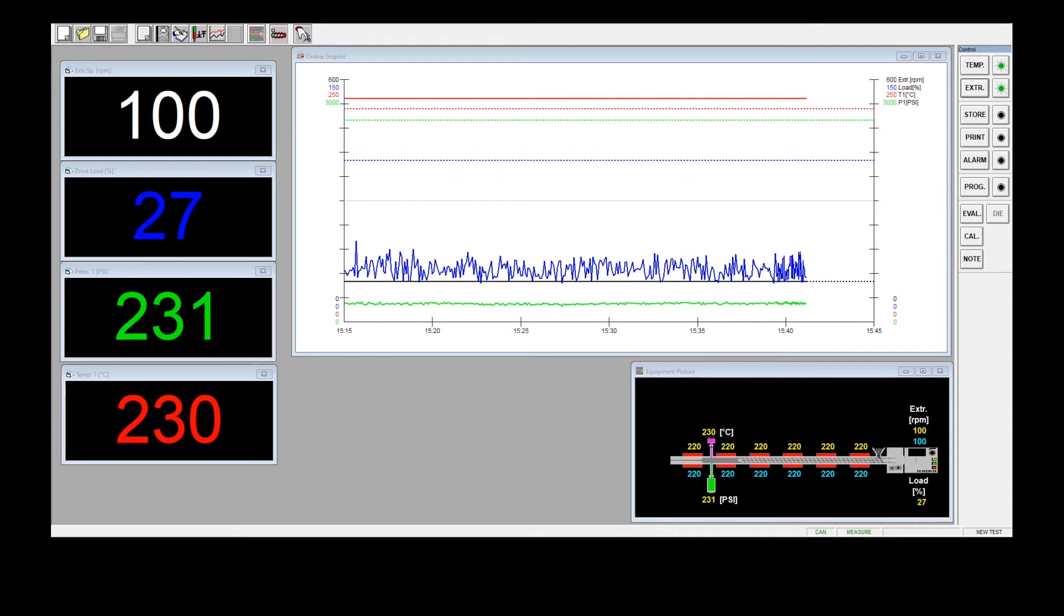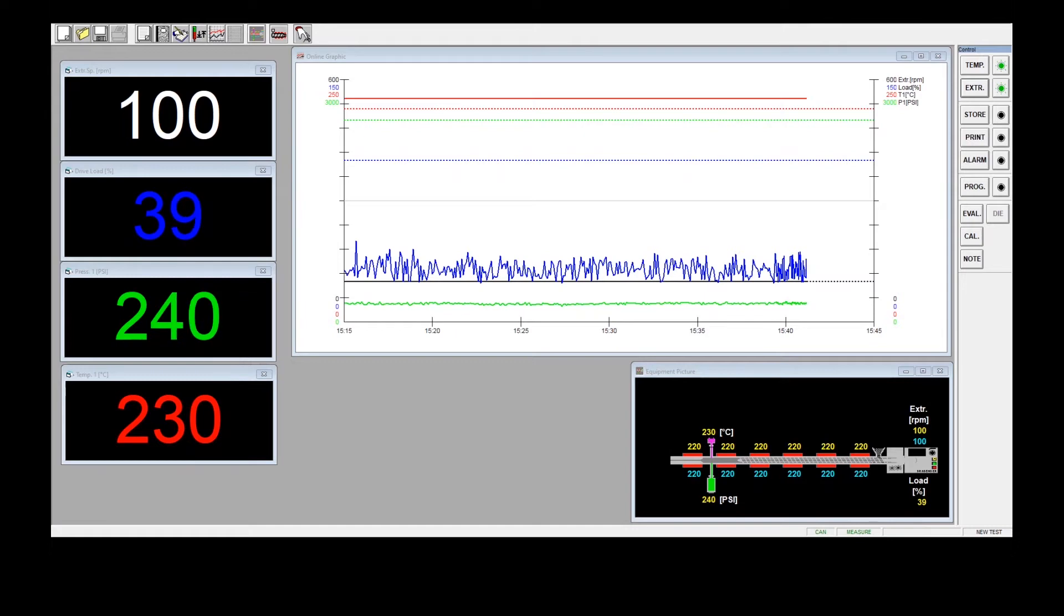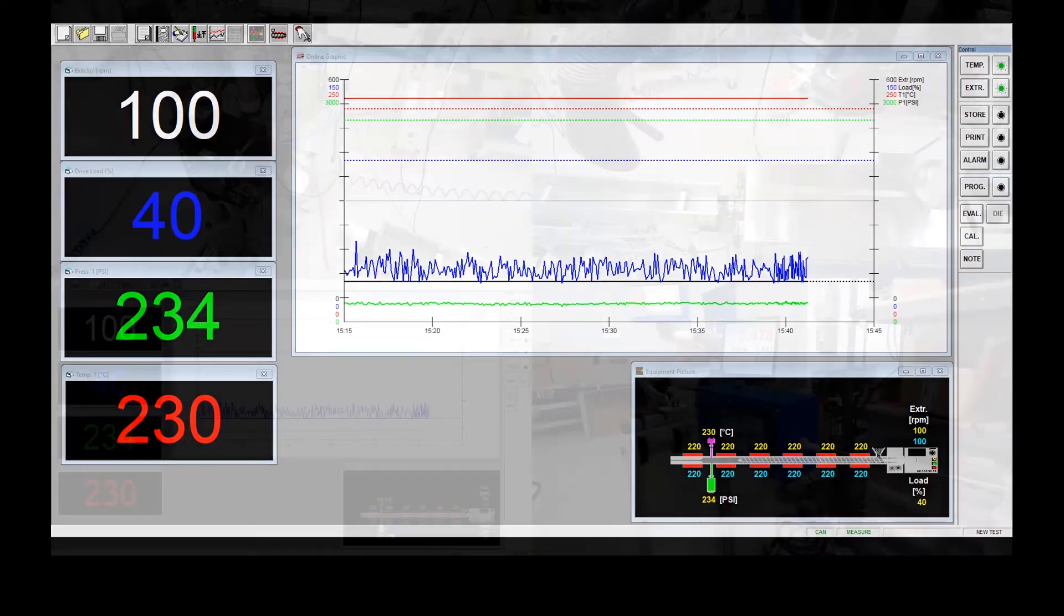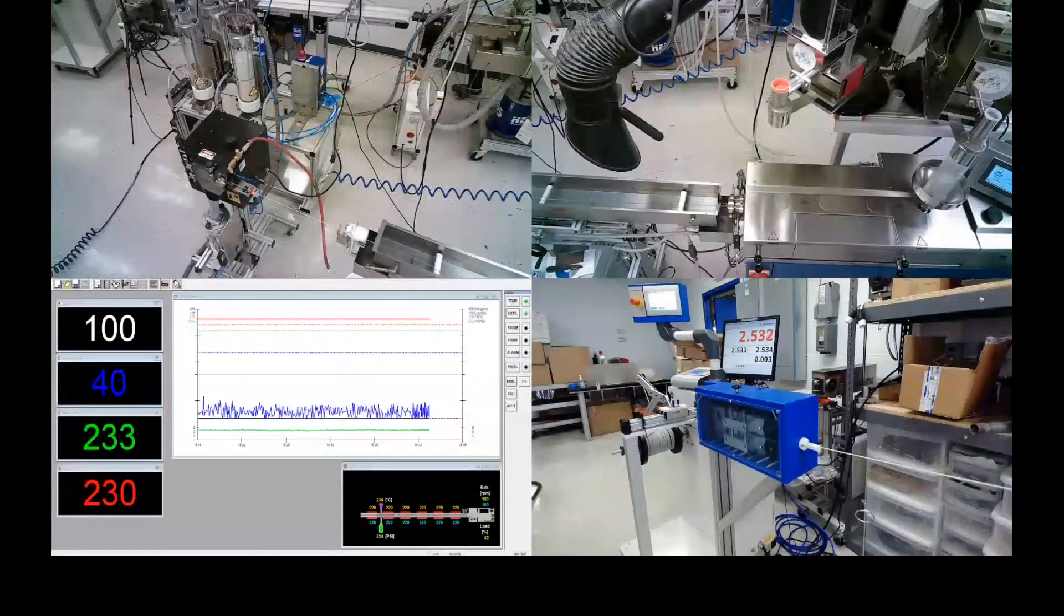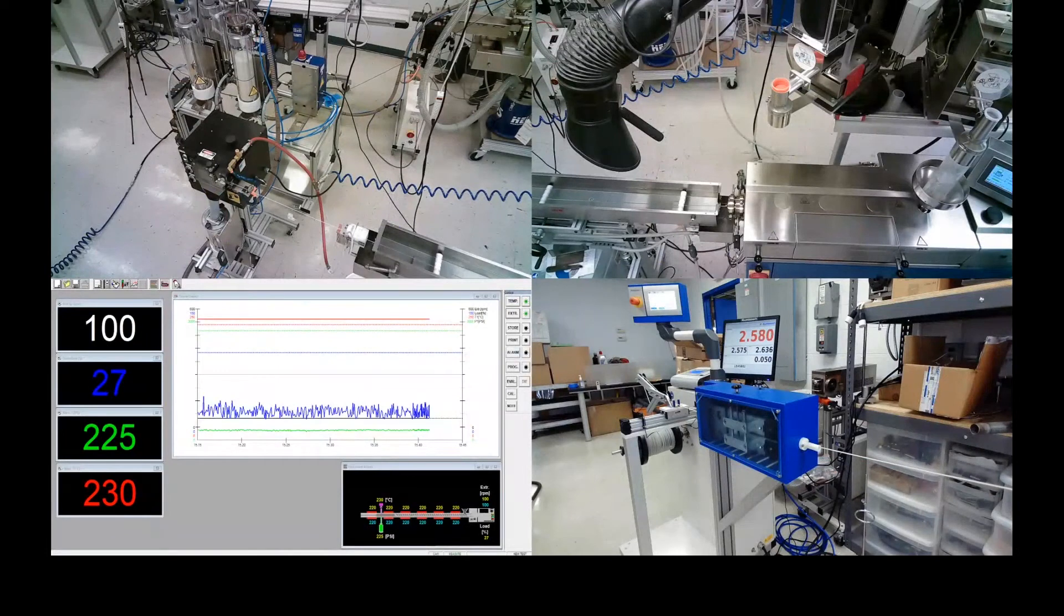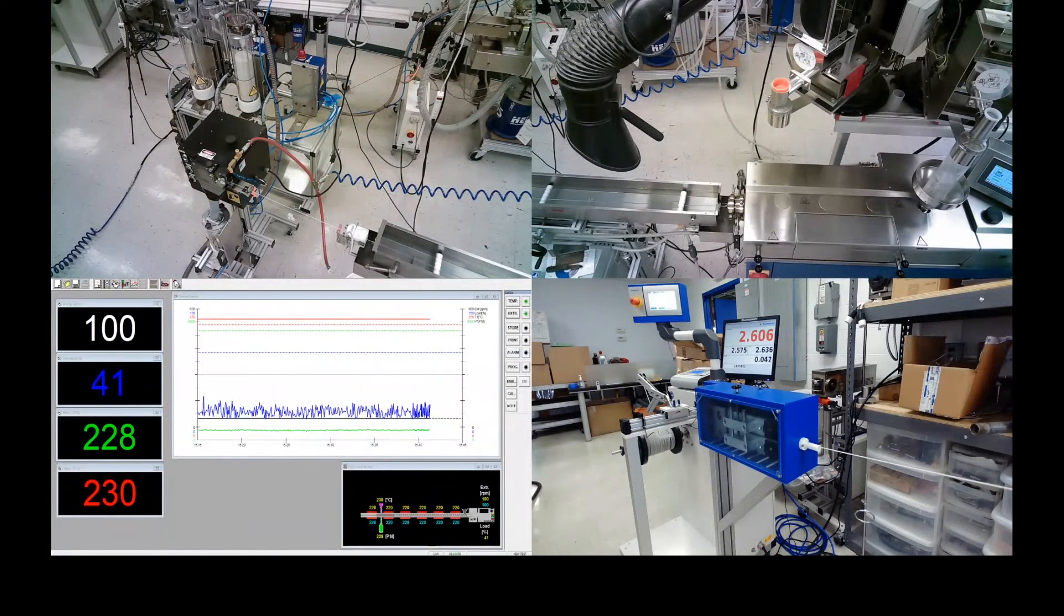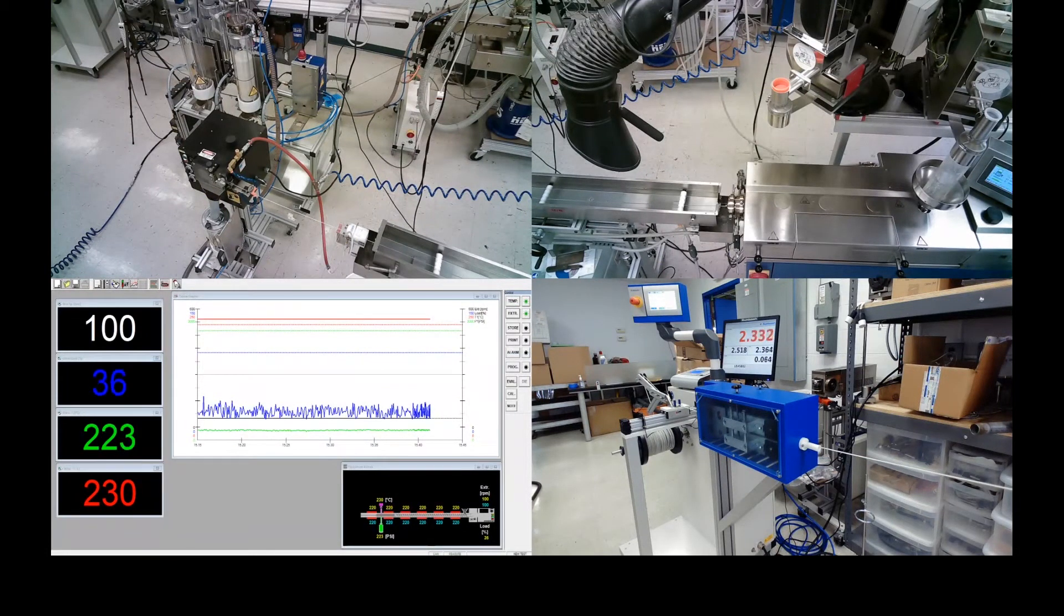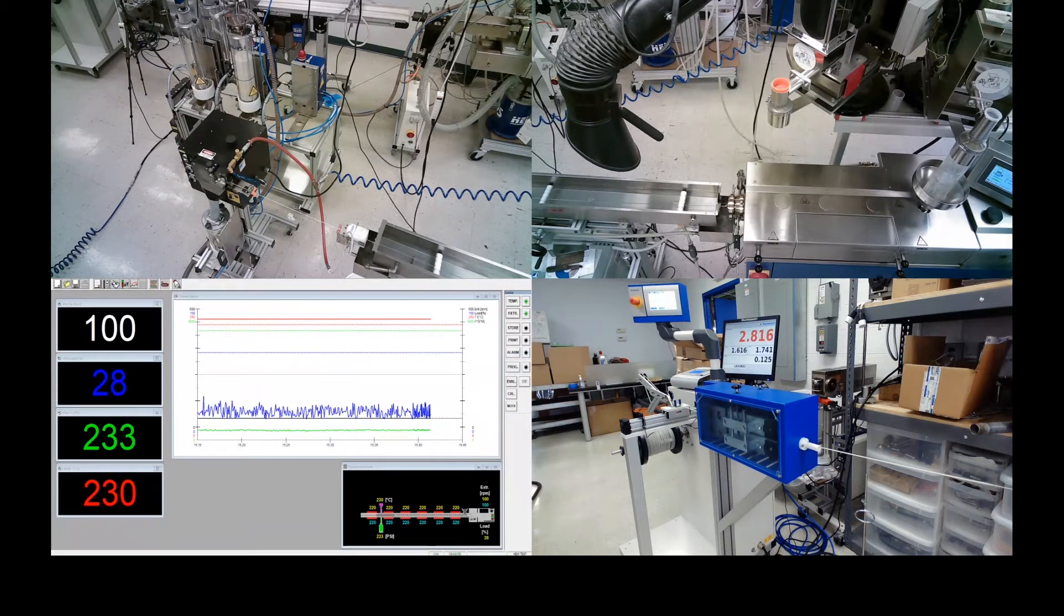You see here the torque, the speed, the pressure and the temperature in a time chart with the equipment and in the four view overview you see the downstream equipment, what happens at the die, what happens at the pelletizer and the drying station.